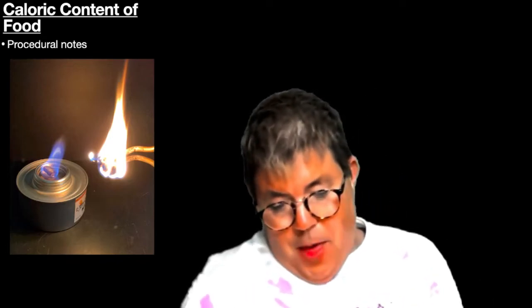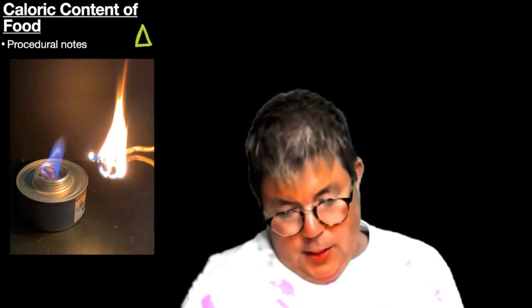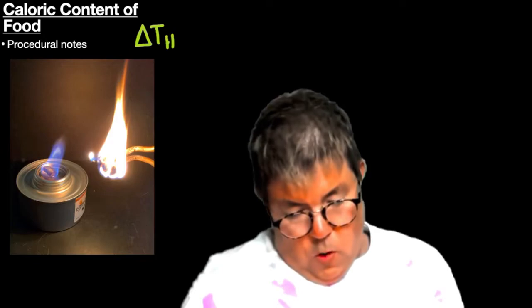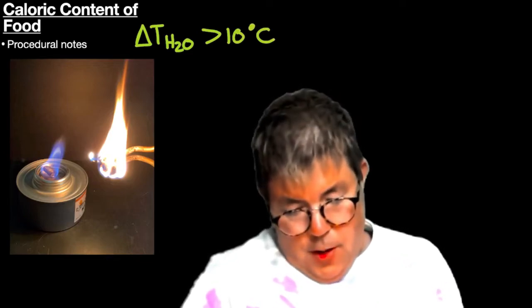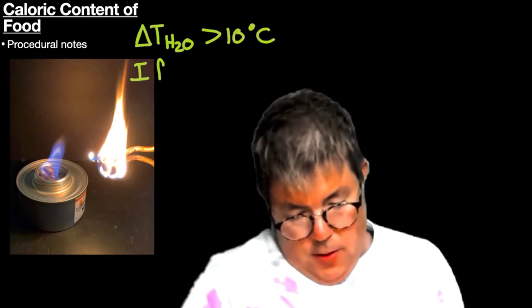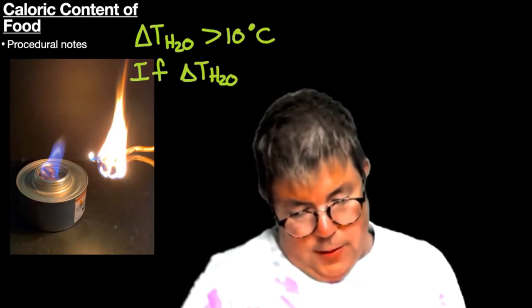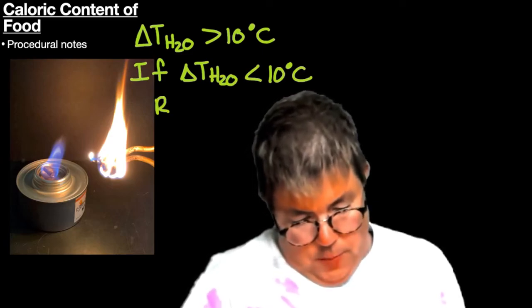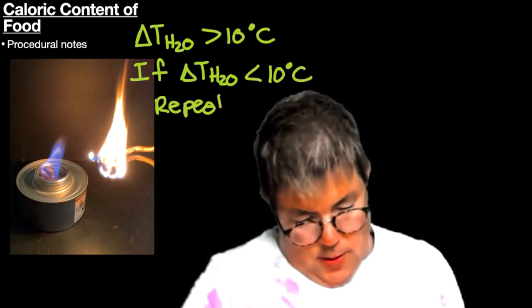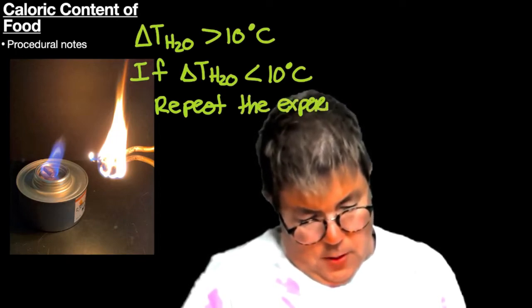So what I recommend is the delta T for your H2O should be greater than 10 degrees Celsius. If delta T H2O is less than 10 degrees Celsius, repeat the experiment.